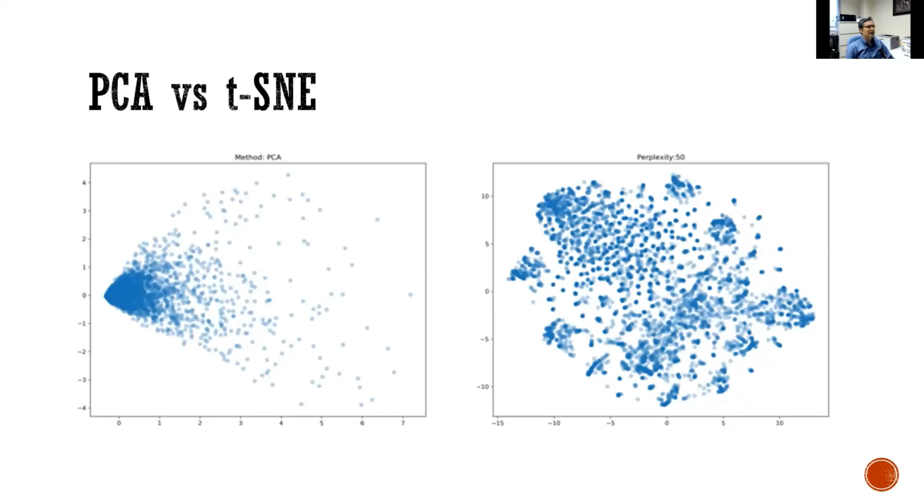Last lecture we mentioned PCA analysis and also tSNE. tSNE is a preferred algorithm over PCA because we tried both on the same data set. PCA will give you a less descriptive picture, so you cannot separate those cells at a higher resolution. The tSNE algorithm will create output that allows cells to be more dispersed, scattered around the space, so you can see the relationship among highly similar cells. Because this is high dimensional data, when you reduce the dimension to 2 or 3 dimensions, you lose a lot of information, and you still want to keep the global structure, but you want to separate the cells to visualize them.